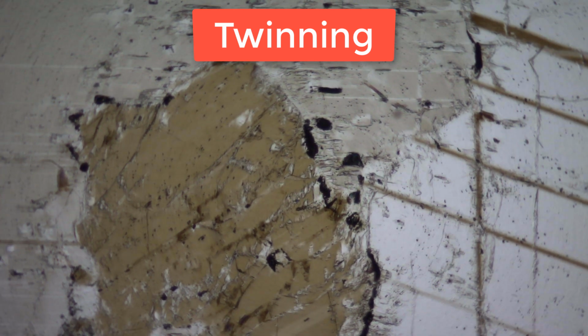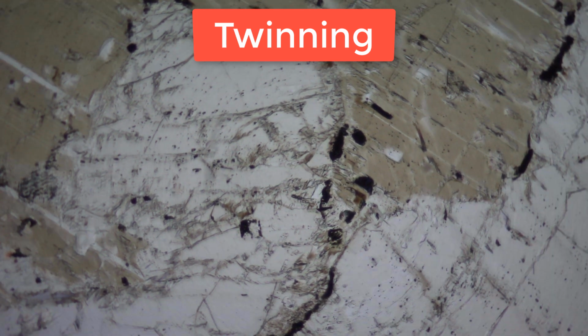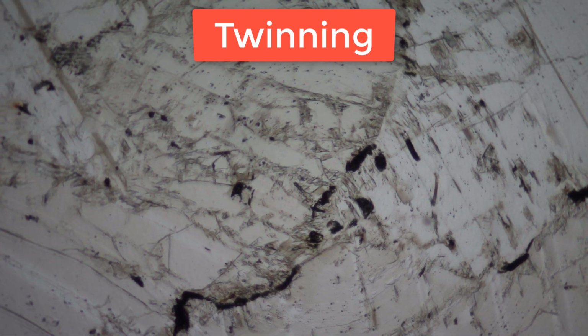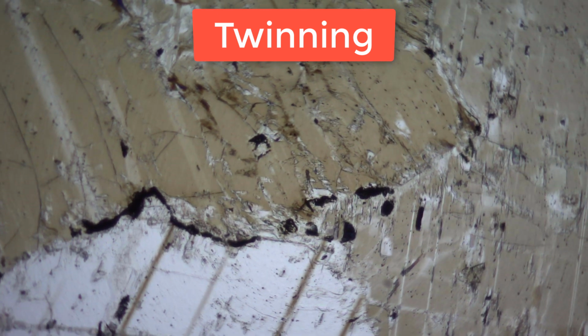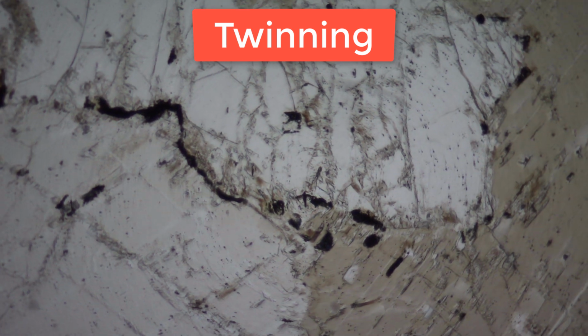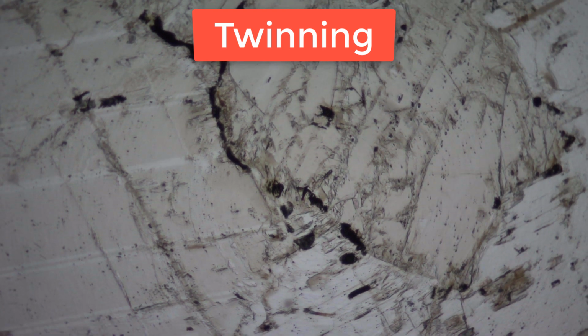Twinning may appear parallel to the length of a crystal and be wide or narrow. It may also occur perpendicular to the length of a crystal. Some twinning patterns intersect at 90 degrees and look like a tartan or plaid pattern. To observe twinning, I recommend watching the video in this series named Igneous Rock Rhyolite Porphyry and its Thin Section.